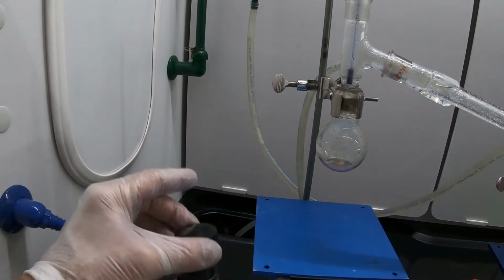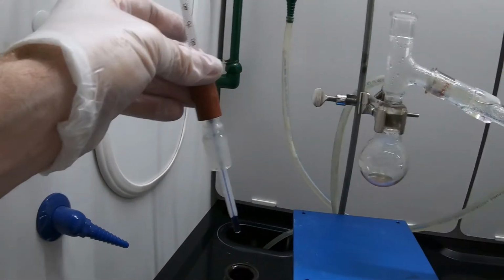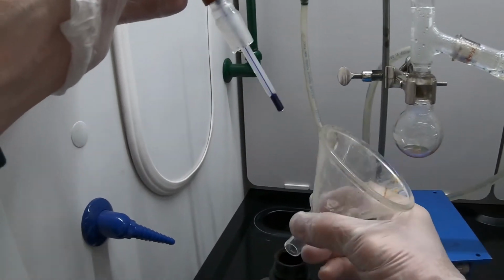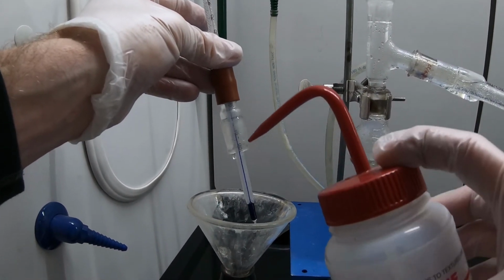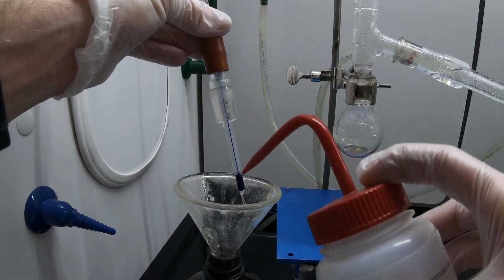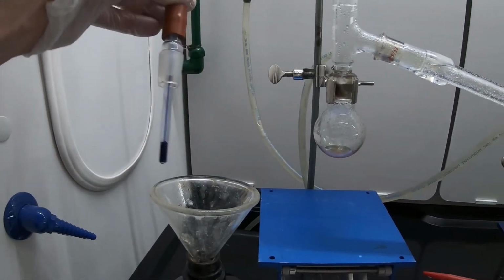All right, so disassembling. Small amounts of acetone, waste container. And again, when we rinse glassware with acetone, we're using an organic solvent to clean things. We want to use a minimum amount, so small rinses are way more effective than great big single rinses.